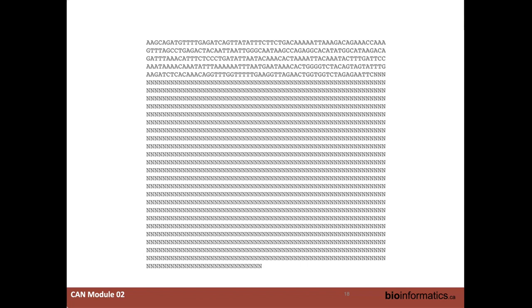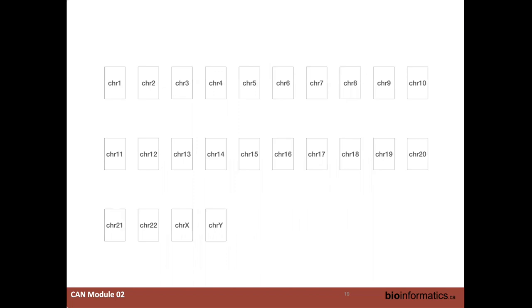Okay, so you saw the mitochondrial DNA. You saw chromosome one. In humans, there's 22 autosomes, X and Y. Some people stick in mitochondrial in there, others don't. I usually do because we do some studies with mitochondrial DNA. But we have all these files scattered about. There's one for each chromosome represented. And again, these are all things you could just download. I can get that reference genome easily, no matter what.